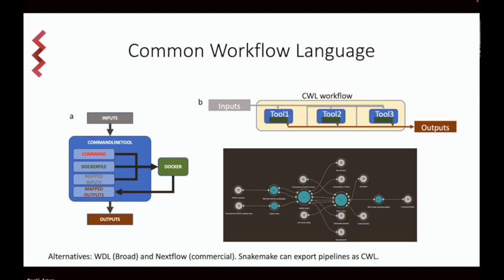As people started publishing more NGS and big data, other people wanted to reanalyze it, and so they started looking at the methods section of the paper and reading how the analysis was done and couldn't reproduce the data. Then people started putting their pipelines on GitHub, and sometimes it was difficult to run. Sometimes the pipelines were dependent, for example, on the version of the operating system and so on, and were not running or were not reproducing the data.